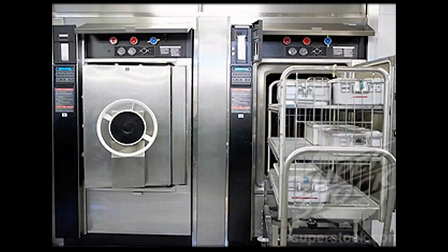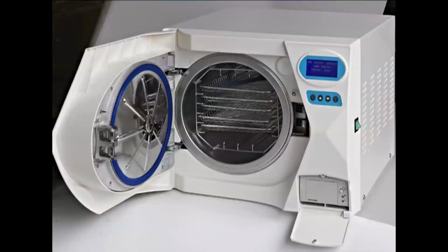To overcome this, we have developed another type of autoclaving that we call a pre-vacuum autoclave. Therein, a separate instrument is used to take out the cold air which was present inside the autoclave. Then the pressure applied is pretty high as compared to 15 pounds per square inch.